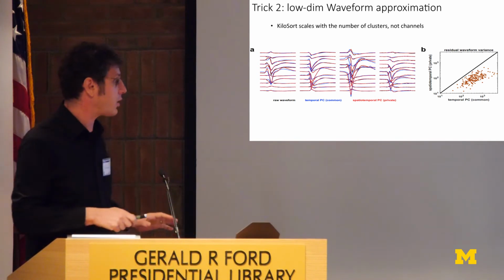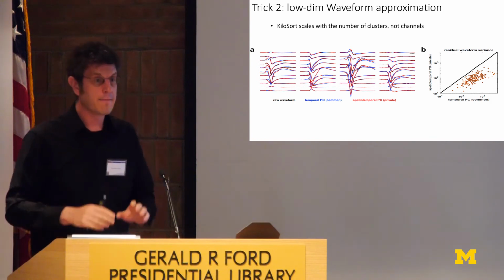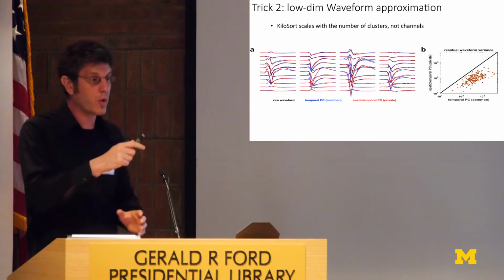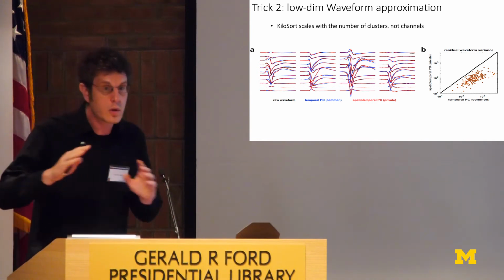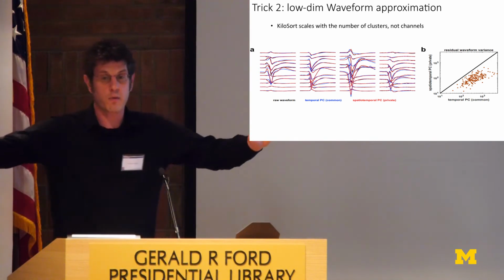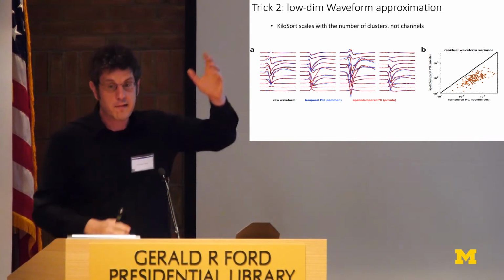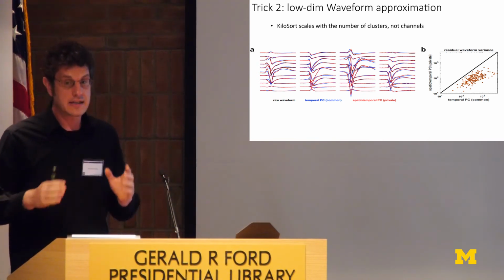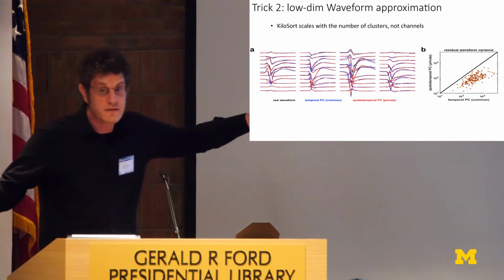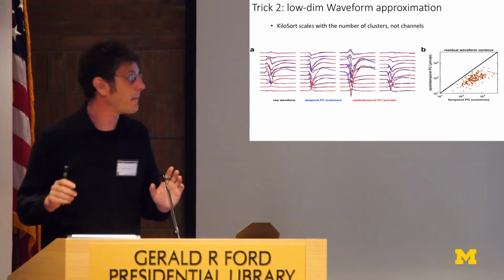It's not that bad, but it's not always perfect. In red is another way of doing it, where you give each spike its own set of principal components. So it expresses the spike waveform on all channels as a sum of a small number of template waveforms. And the point is that although different neurons have very different waveforms to each other, for a given neuron, the waveform on the different channels is relatively similar. There's only a few degrees of freedom. So it's able to compress the hundreds of dimensions of channels to just about 3 dimensions per cluster.